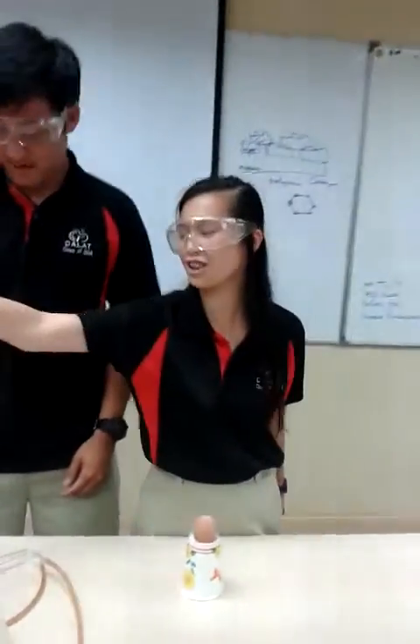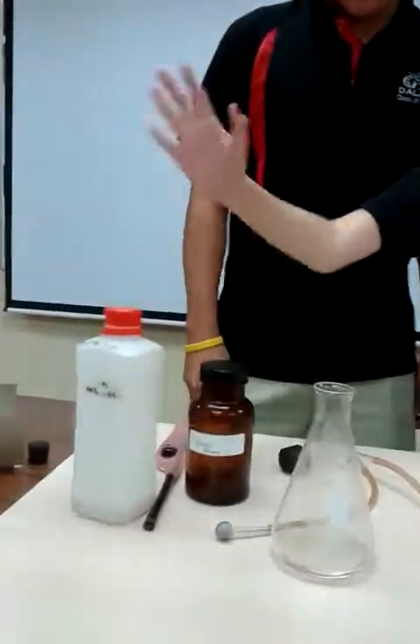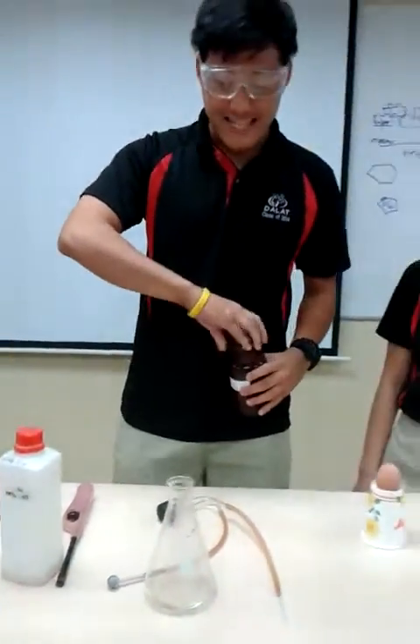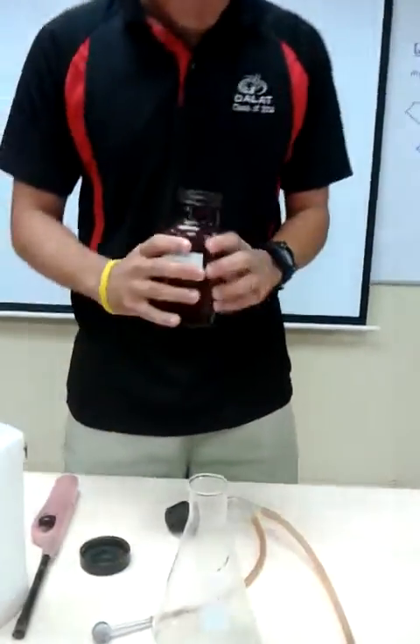Micromolecules. So we're going to start off by mixing an acid with zinc to create hydrogen gas. We already have acid inside this beaker, so we'll add a bit of zinc inside.